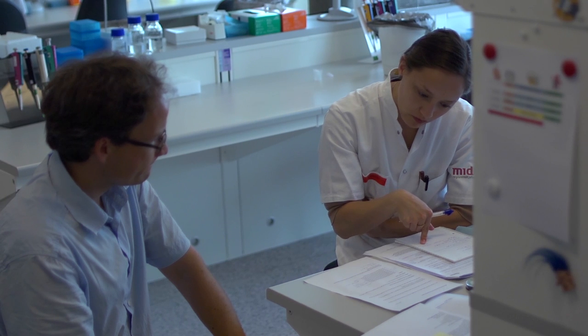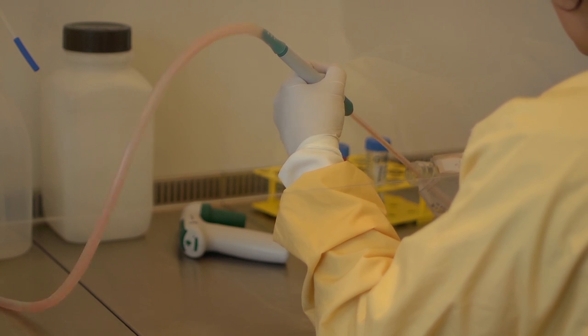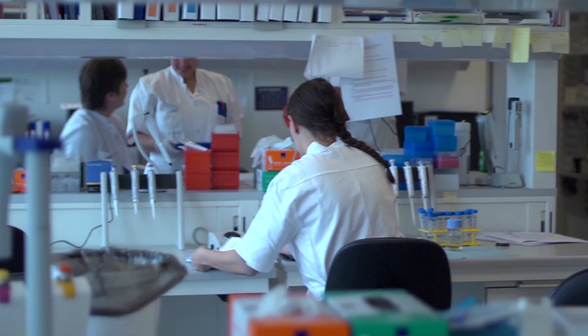Hi, I would like to introduce you to our study describing a method for specific quantification of disease-associated proteins in maple syrup urine disease. For this type of disease, it's important to quantitate multiple proteins in the same sample. And our mass spectrometry-based method developed in our proteomics lab is suitable for this.